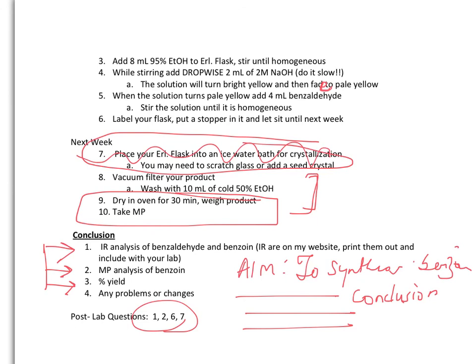And then you will run the second half of this, which we are going to follow the book for, and that's simply an HNO3 oxidation. We do not use again the KMnO4 and the periodic acid, because periodic acid is going to cleave that molecule. Even though it's a great oxidizing agent, it can cleave right here.